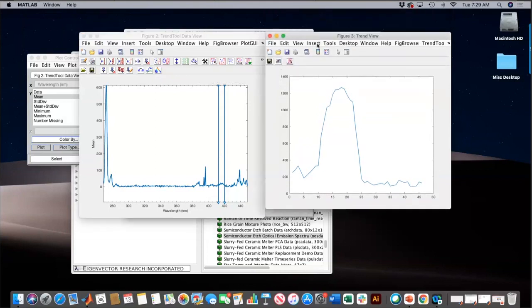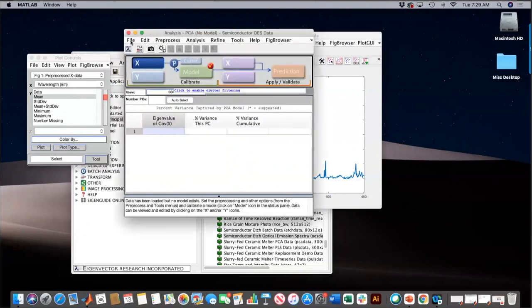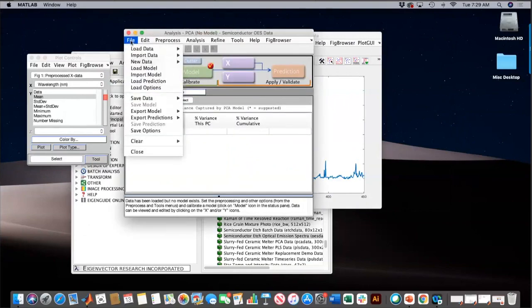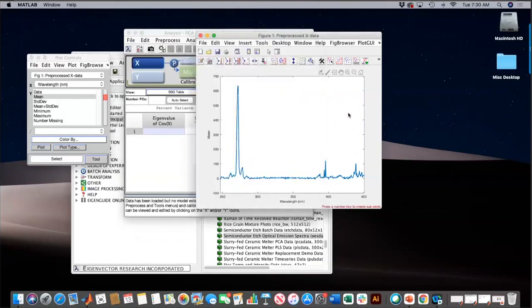So let me get back to the presentation. If you've got any questions in the meantime, let me know. Barry, do you want to show real quick how you would normalize to a region? Or do you want to do that at the end? Yeah. Will you help me with that, Bob? Certainly. Okay. So you could start with your pre-processed data right there.